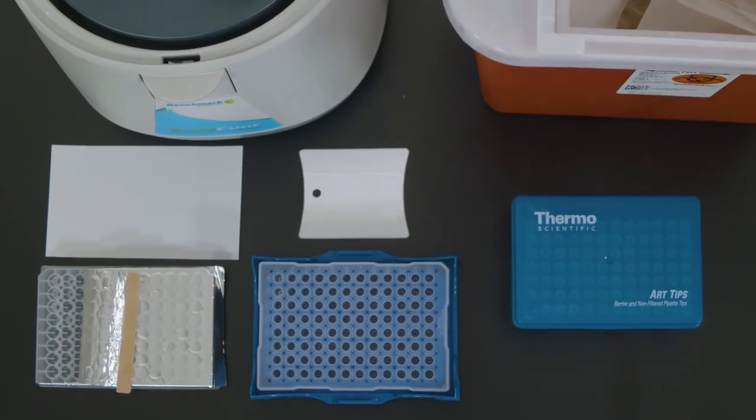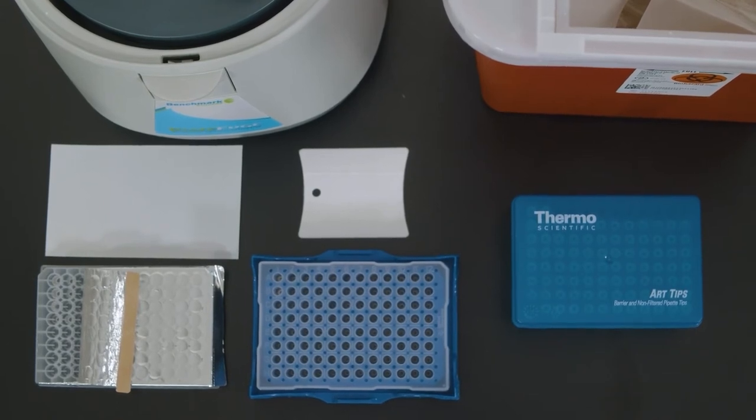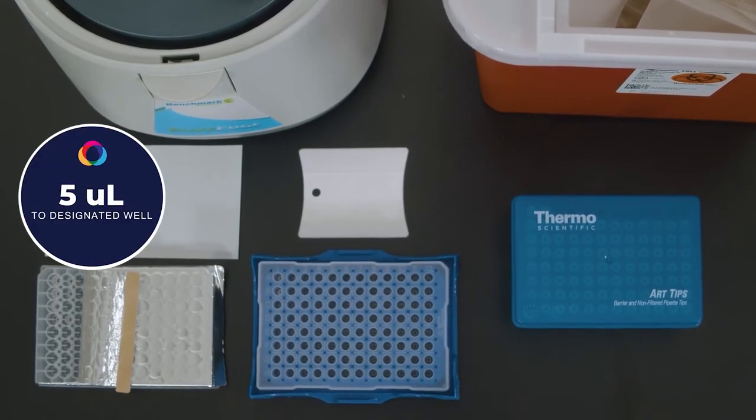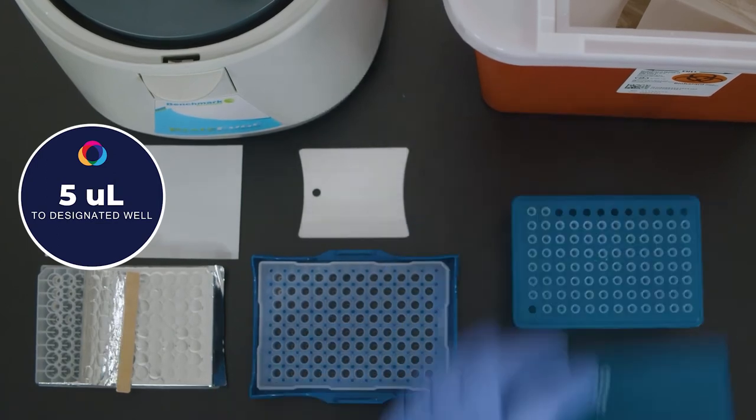Move to the RNA sample preparation area with the PCR plate containing the RT-PCR MasterMix and add 5 microliters of each sample to each designated well based on how you've designed your experiment.